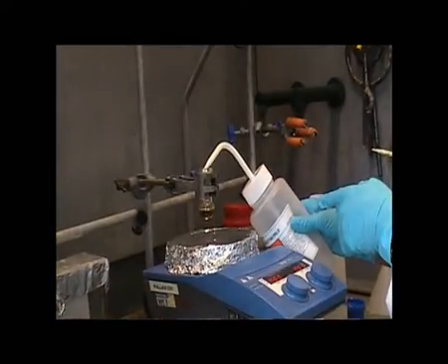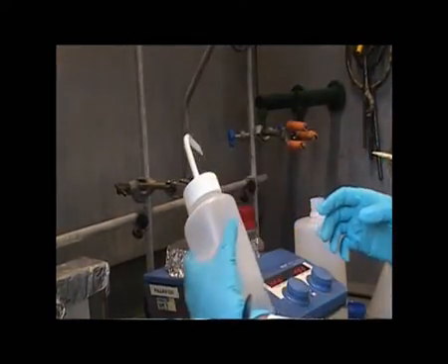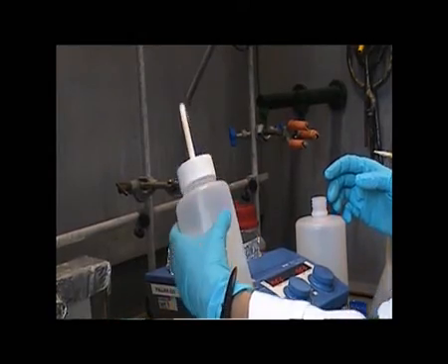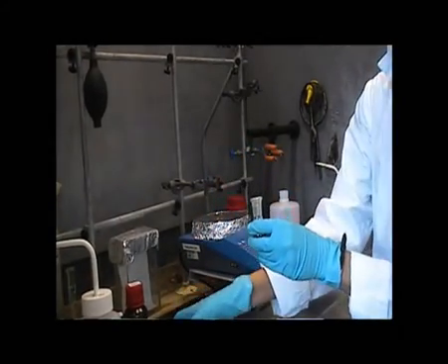We then also wash the neck of the flask to remove any traces so that they are not detonated by the twisting action of ground glass joints.